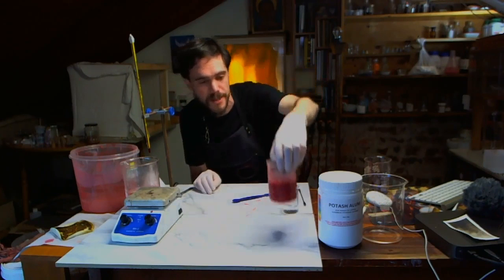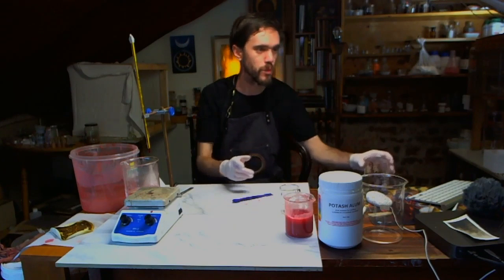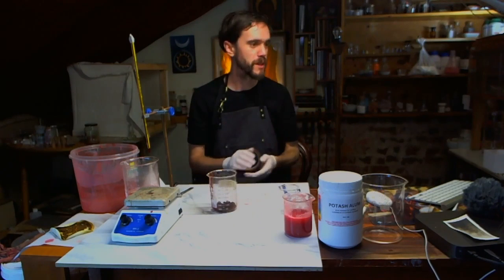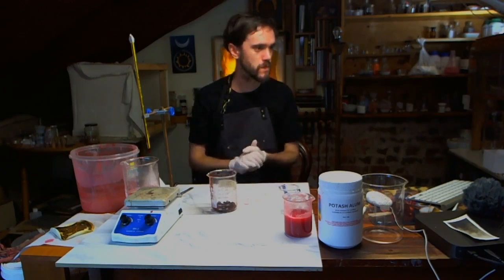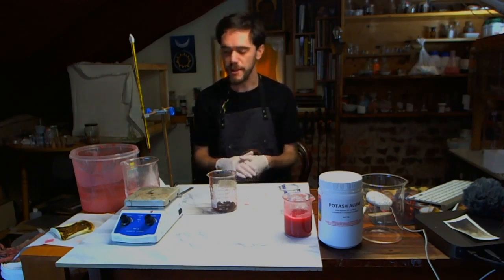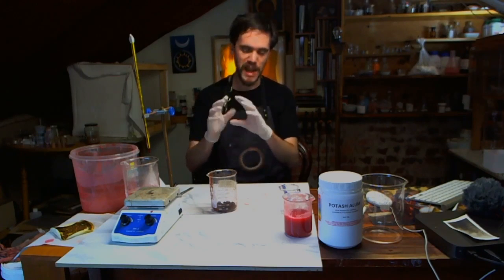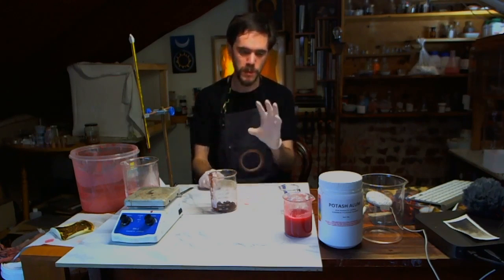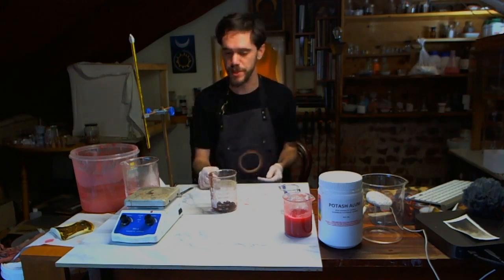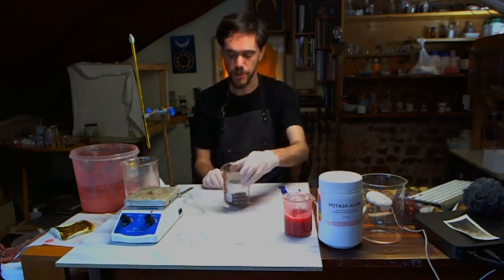So we'll let that settle to the side. We'll let the pigment settle out, and we'll move back to this guy here. But that's cool. Alright, so we learned something. Yes, when you add sulfuric acid to sugar, you get carbon and steam. I think with this you'll get the blackening of the root material, which is probably the carbonization of the root material. But again, I haven't done enough experimenting with that.